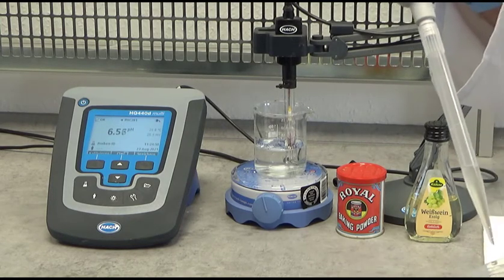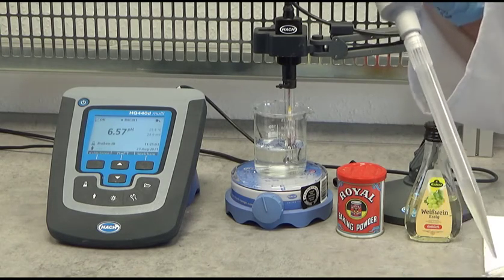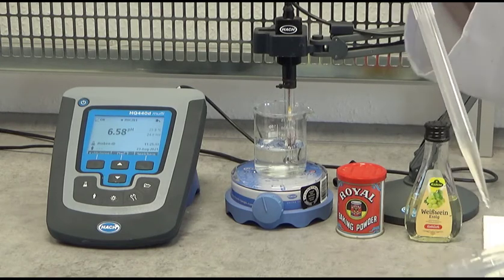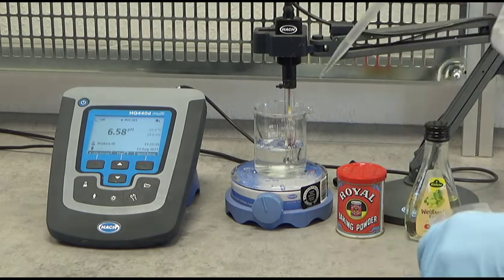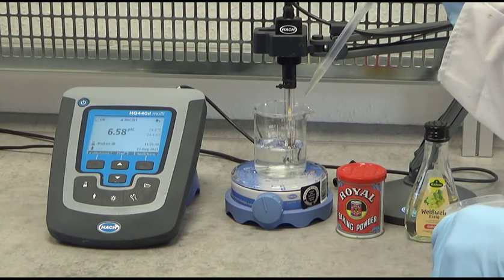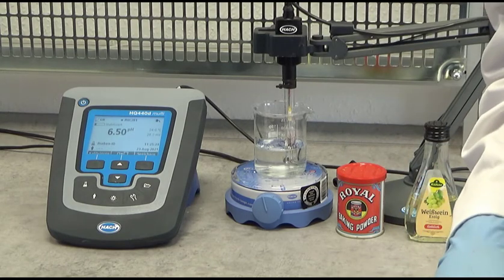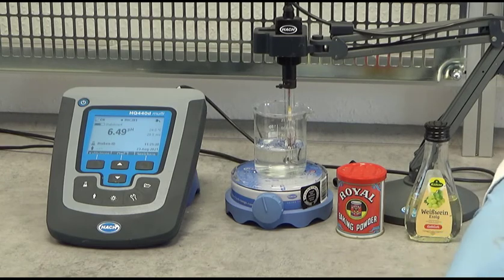That is why alkalinity is also referred to as the buffer capacity of water. The alkalinity buffers the water so that the pH is not changing very much by adding an acid. I add a last few drops — one, two, three — and you can see the pH is not changing very much. That was a short demonstration of what alkalinity is.